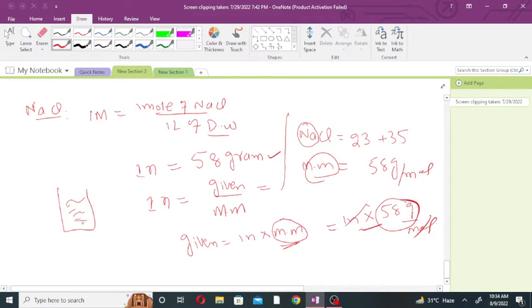and we will dissolve it in 1 liter of distilled water. So we will prepare 1 molar NaCl solution. Now in order to prepare 0.1 molar NaCl solution, we will take 5.8 gram of NaCl and we will dissolve it in 1 liter of water.